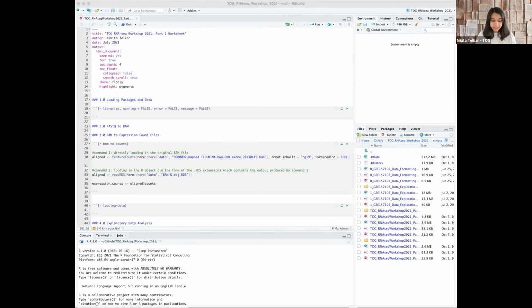Once you get your FASTQ file, there are a couple of steps that you might have to go through, like trimming the adapters, making sure that you only retain the sequences that you want. As an overview, for my files, I would have to trim the UMI, which is the unique molecular identifier at the start. Then I have my microRNA sequence, my index adapter, my index primer, my adapter. All of these things I need to remove. And then I need to further trim down to only the sequences that are about 17 base pairs in length, because that's the minimum length of a microRNA.